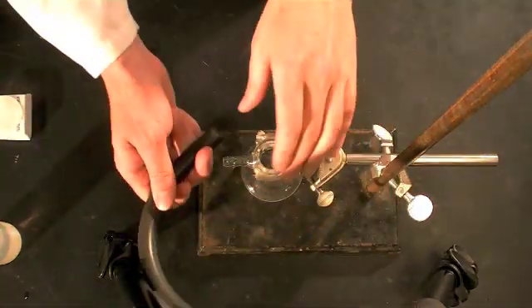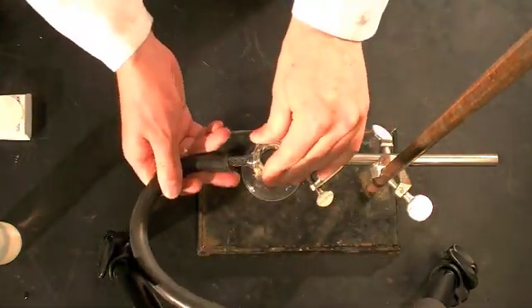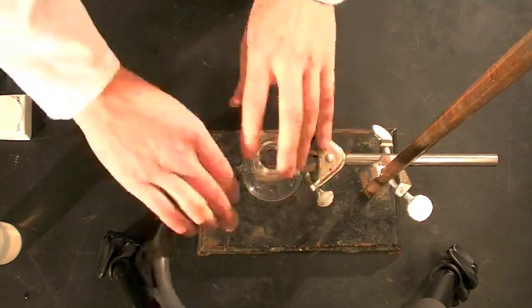Attach your hose to the vacuum and then to your sidearm flask.